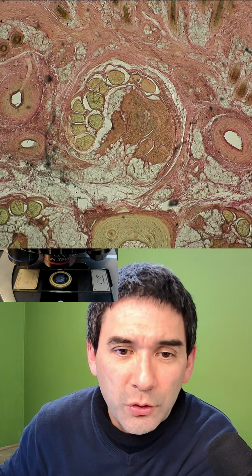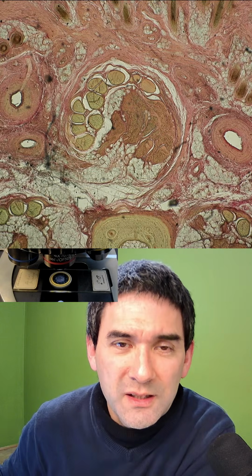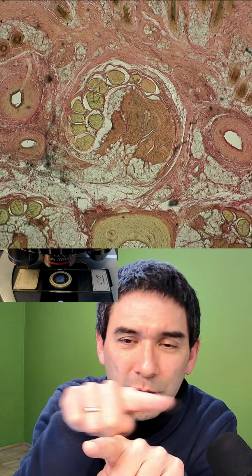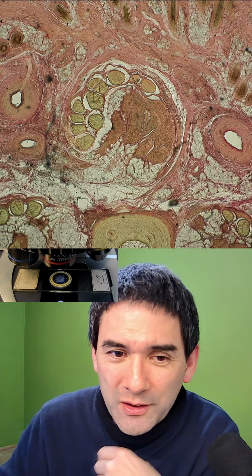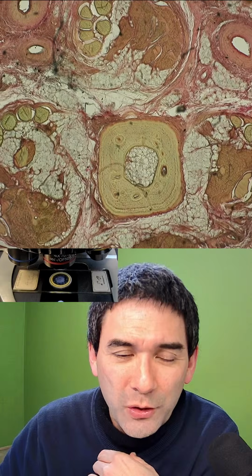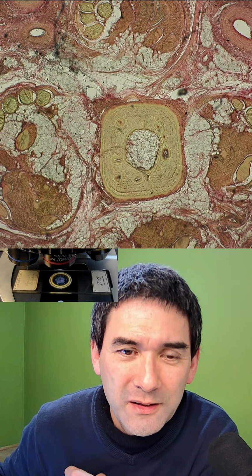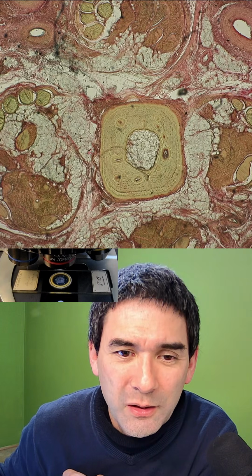You've got over here muscles. So it's kind of interesting. You've got basically a pair of muscles that are moving it like this, and a pair of muscles that are moving it in XY direction. Here in the center, that is bone of the tail. That seems to be the marrow. Again, here, muscle down here, up here, left and right as well.